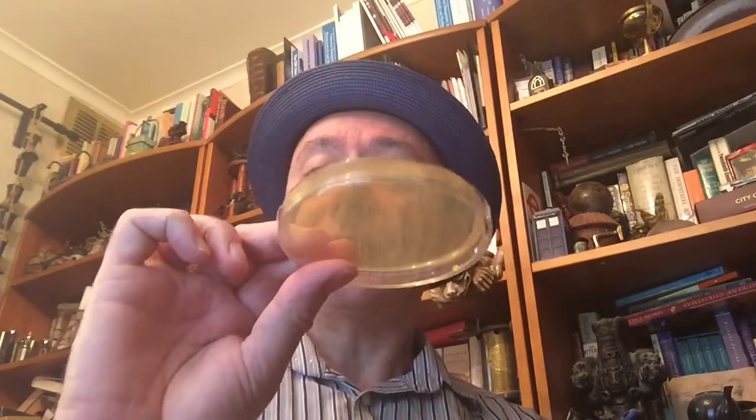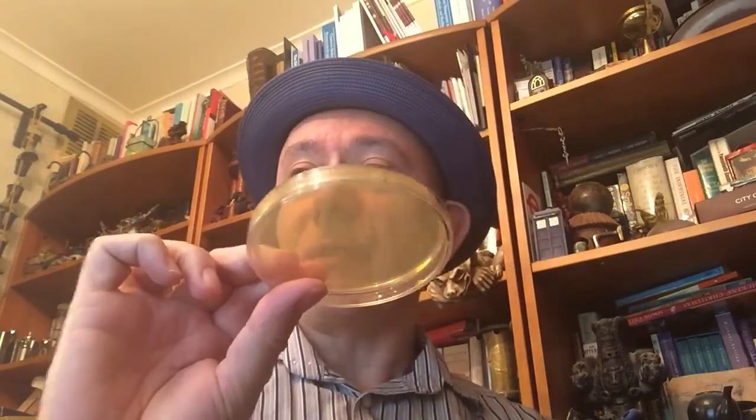These include water, a source of energy, sources of carbon like glucose or nitrogen from amino acids, sulfur, phosphorus, minerals, metals, buffer salts, vitamins, and a whole array of growth factors. And this plate contains all of those things I've listed.